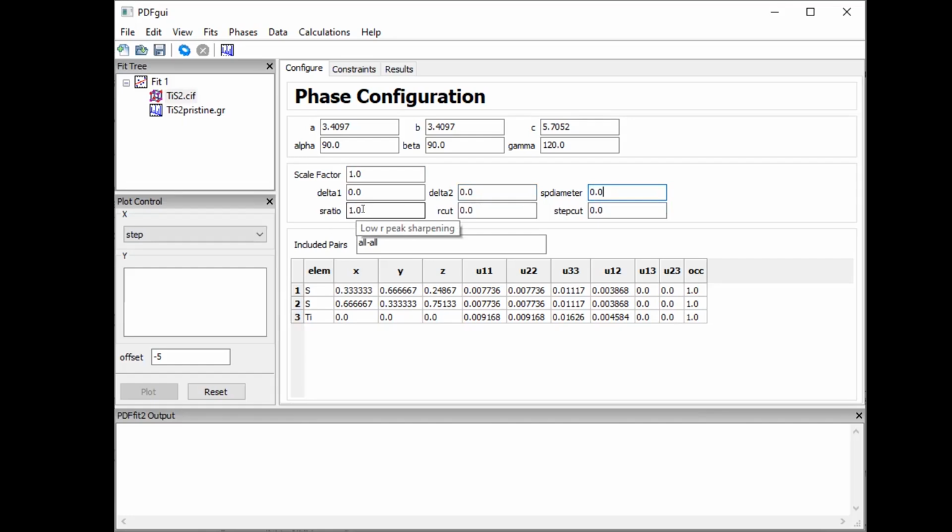If you really want to know the details, you can also check the menu there. So this one is basically also related to the peak sharpening. These two parameters are much less frequently used than these two. So normally, I think it's not really necessary to get involved with these two, but if you insist, you can check the menu and seek guidance on these two parameters.